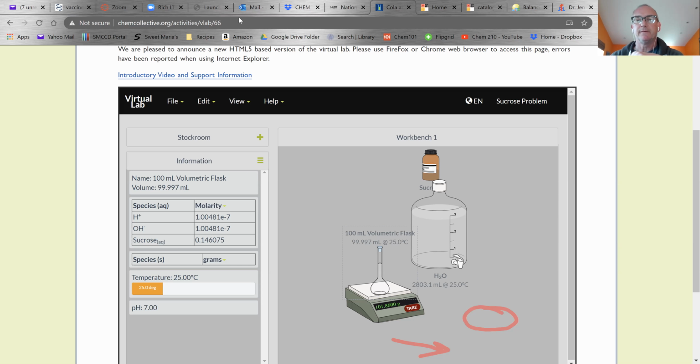What's the density of that solution? Has everyone gone to sleep? What's my density? I have a mass, but I'm not going to be plotting mass. I'm going to be plotting density. No one can tell me what the density of the sucrose solution is.